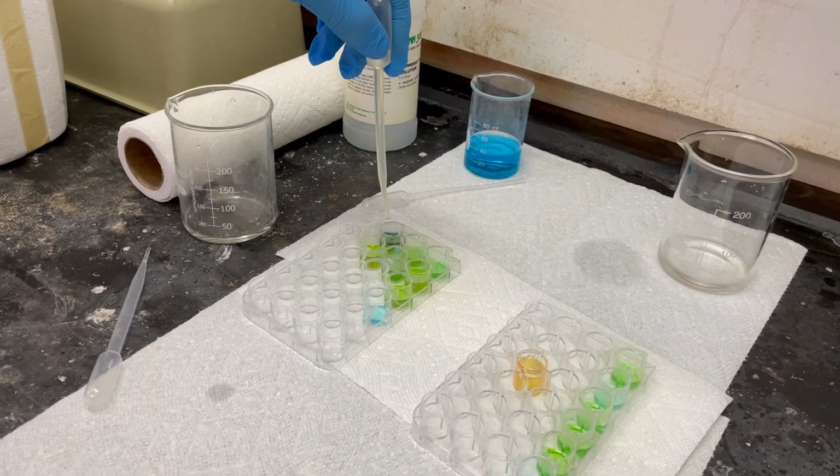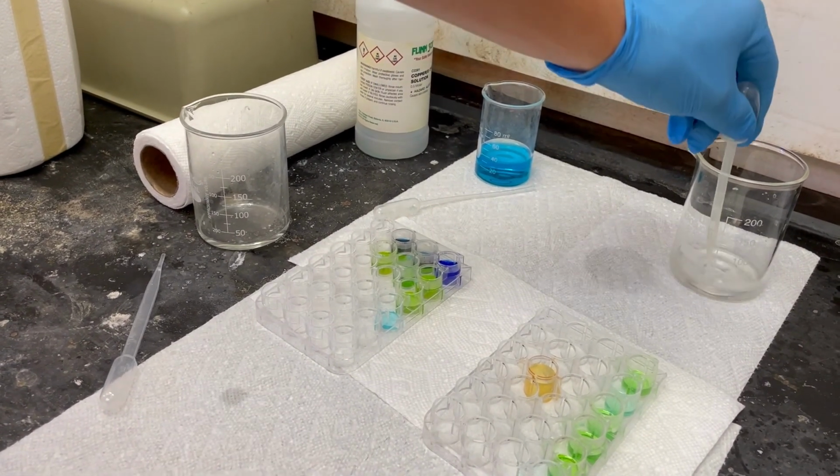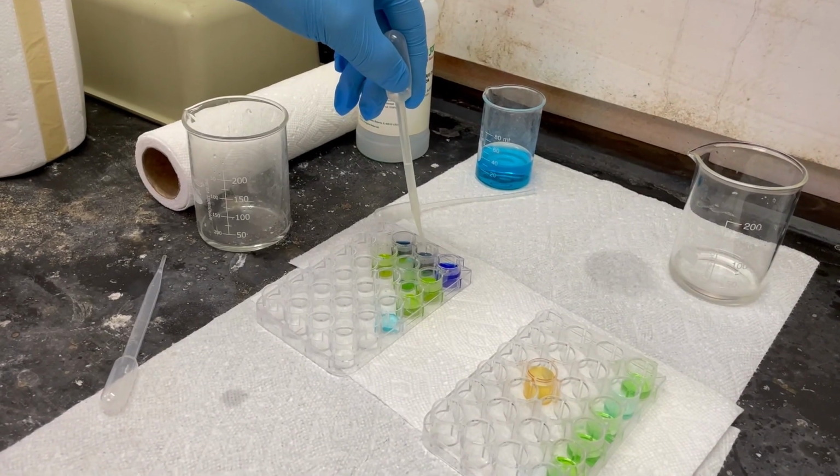By adding more ammonium hydroxide to the solution, it shifted back into the completion of the products, with a complex of water, copper, and ammonia.